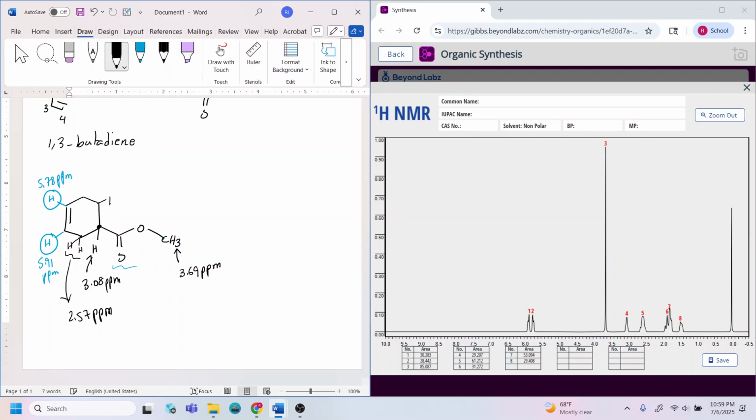So we do have hydrogens here that are in different environments. So we have these 2 hydrogens here, and then we have these 2 hydrogens in there. These 2 hydrogens, for some reason, are showing as 2 separate peaks. Now, in reality, they are just one. They should be just one peak in there, but they are showing as 2 separate peaks.